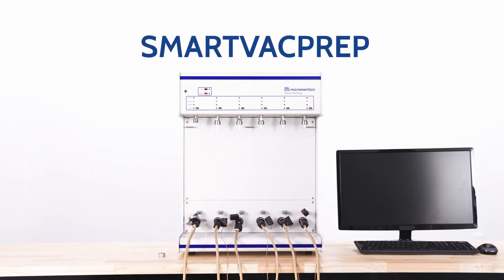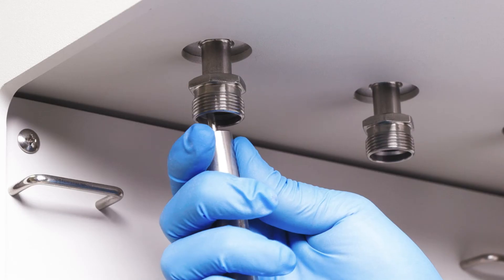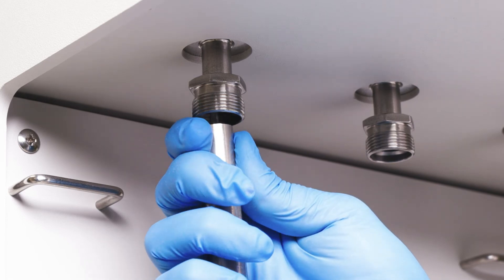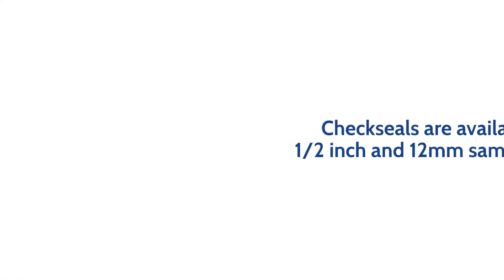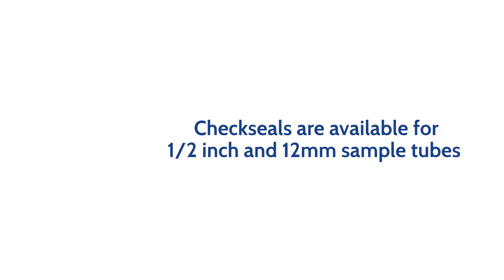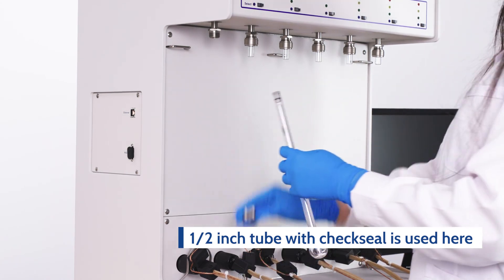A SmartVacPrep automates a majority of the degas process, saving you valuable time. Pins should be removed from the sample port if check seals are not used. Check seals are available for half-inch and 12 mm sample tubes. A half-inch tube with check seal is used in this demonstration.